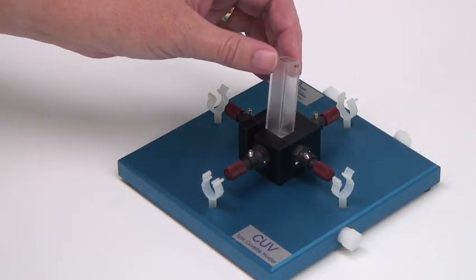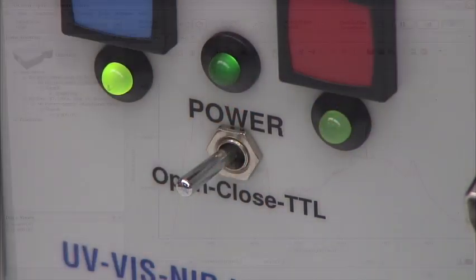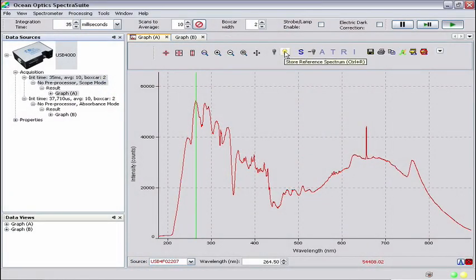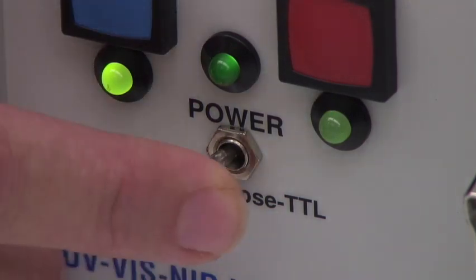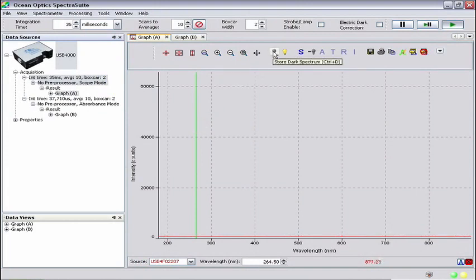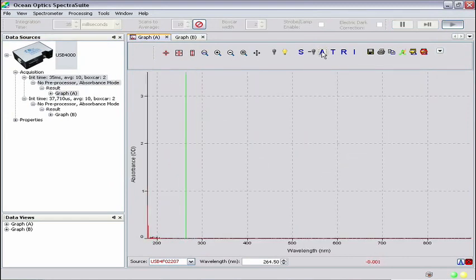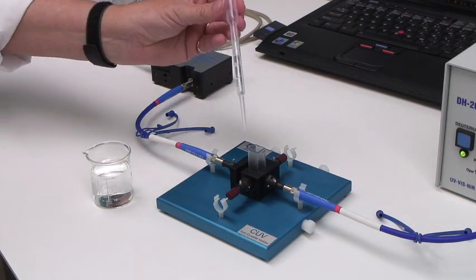Use 10 scans to average and set a boxcar width of 2. Place a blank cuvette in the cuvette holder — this will be our reference. Make certain that the shutter on the light source is open; the switch should be flipped to the left. Click the yellow lightbulb button to store the reference spectrum. Flip the toggle switch to the middle or closed position to close the shutter. With the shutter closed, click the gray lightbulb button to store your dark spectrum. Now that we've stored a reference spectrum and a dark spectrum, the processing mode icons will turn blue to indicate that they are active. Click on the letter A for absorbance mode. With the blank reference cuvette in the holder, you should see a spectrum with zero absorbance, just as you did in the absorbance wizard.